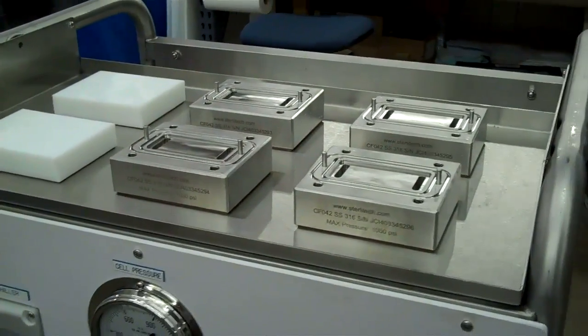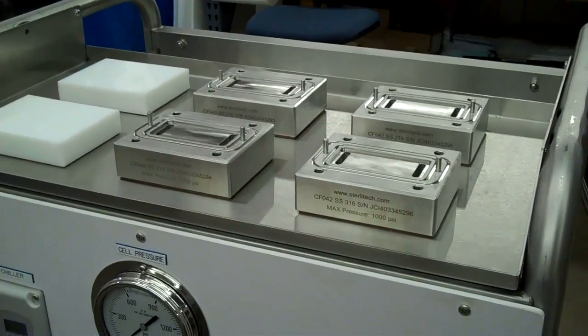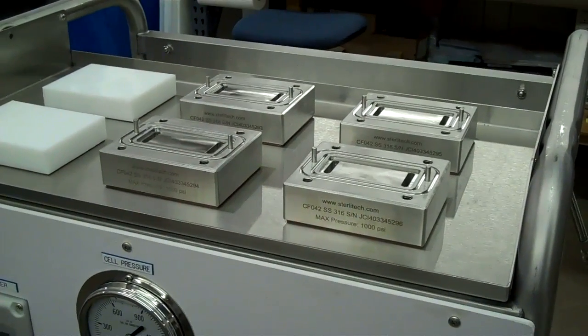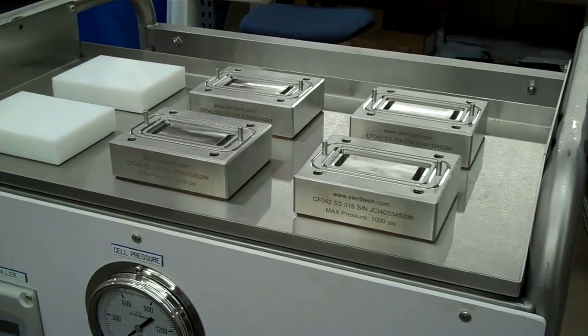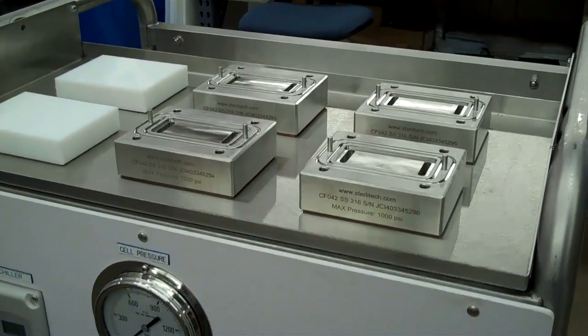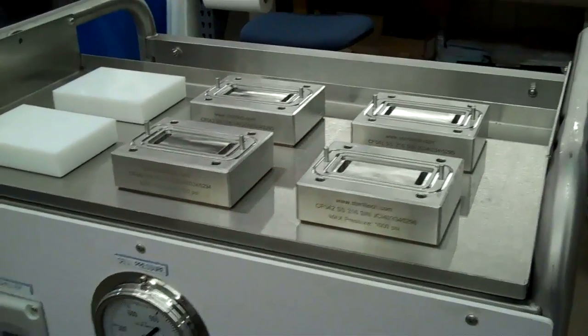The front is cells one through three, or in this case one through two, and the second is cells four through six. You can run them as a total of four cells running in two sets of two series.